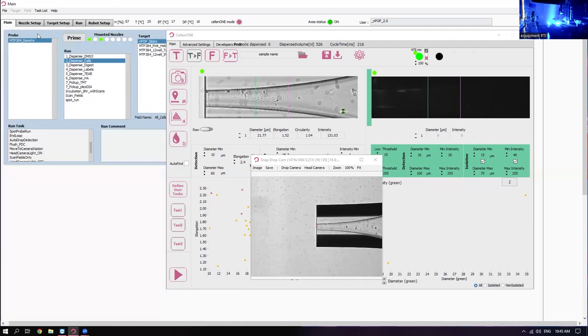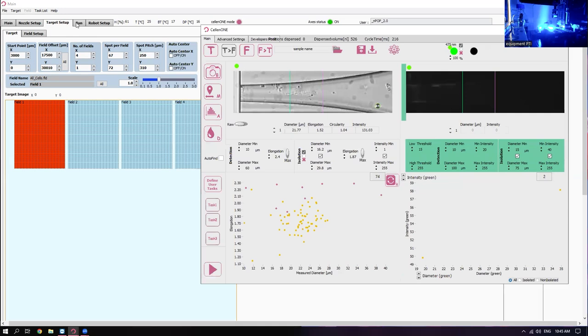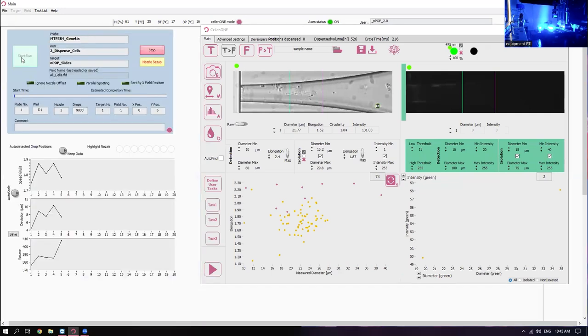All right, so I've done my two things. I've selected my run. I've selected my fields for the cells. And I've got my cells in the tip of the nozzle here. So I'm going to start the run.